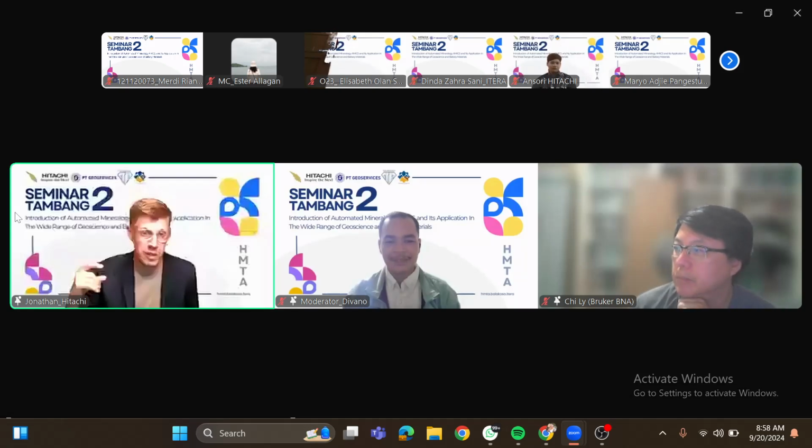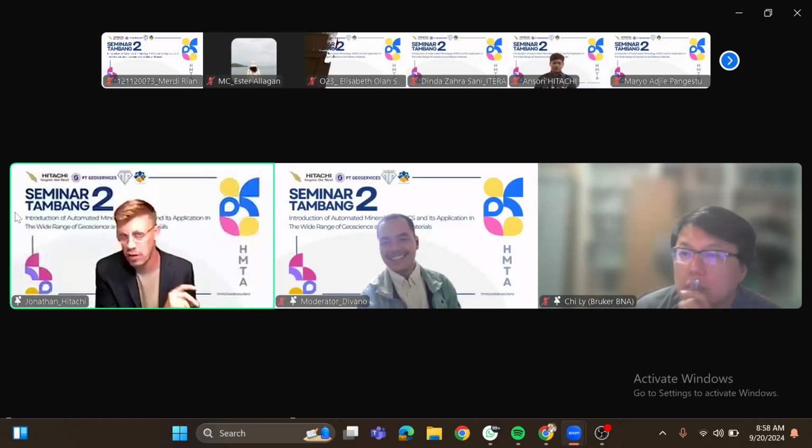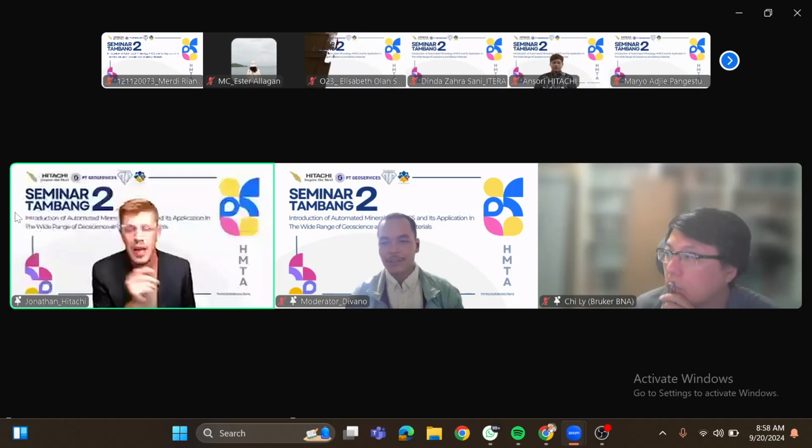And so we have to go back into the system and add new standards from our data. We don't have to go find standards. We can generate them from our data. And then the classification model gets better, right? And because that is a programmatic approach, we're using the physical and chemical characteristics of the materials themselves in its classification. That can be used with confidence to train models, right?